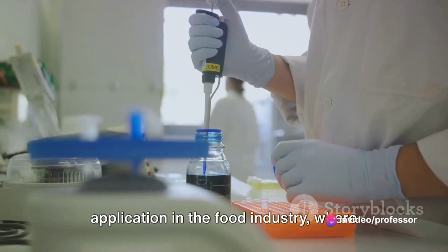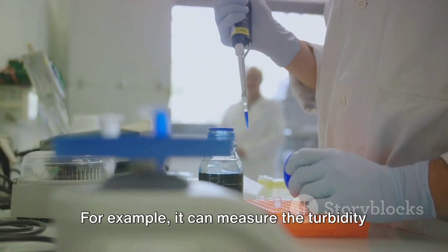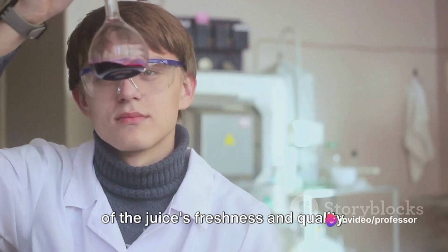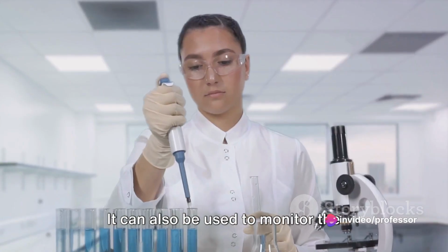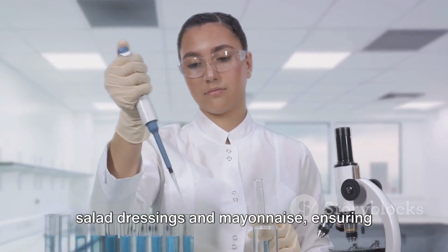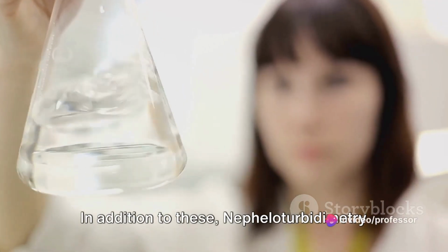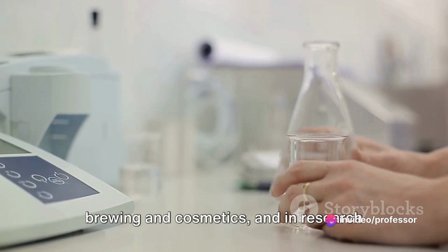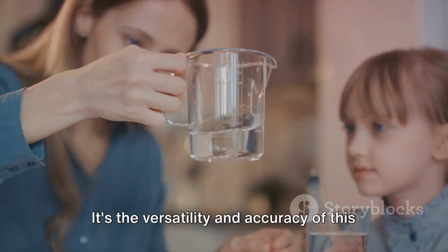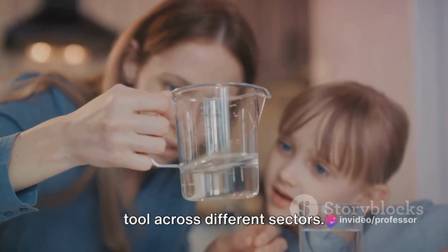Nepheloturbidimetry also finds application in the food industry, where it's used to assess the quality of beverages and liquid food products. For example, it can measure the turbidity of fruit juices, providing an indication of the juice's freshness and quality. It can also be used to monitor the stability of emulsions in products like salad dressings and mayonnaise, ensuring they maintain a consistent and desirable texture. In addition to these, nepheloturbidimetry can also be used in industries like brewing and cosmetics, and in research fields such as nanotechnology and colloidal science. It's the versatility and accuracy of this technique that make it such a valuable tool across different sectors.